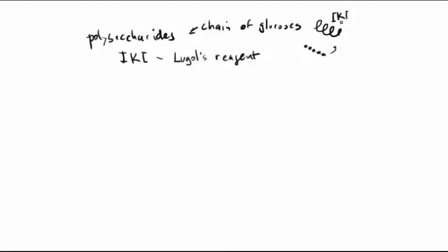this molecule of IKI is going to fit in there, which causes a change in the structure. It makes what's otherwise a transparent or not terribly visible thing turn dark blue. It's a really nice and easy thing to read. We'll be using this IKI with starch reaction in next week's laboratory to detect the presence of starch again as we do our enzymes lab. So in any case, that's our system number 1.